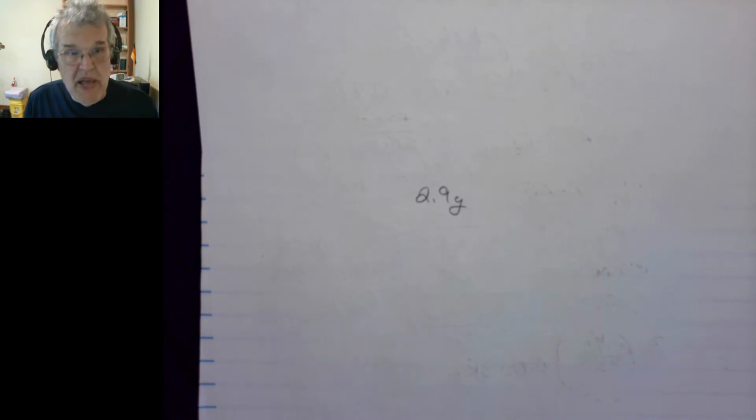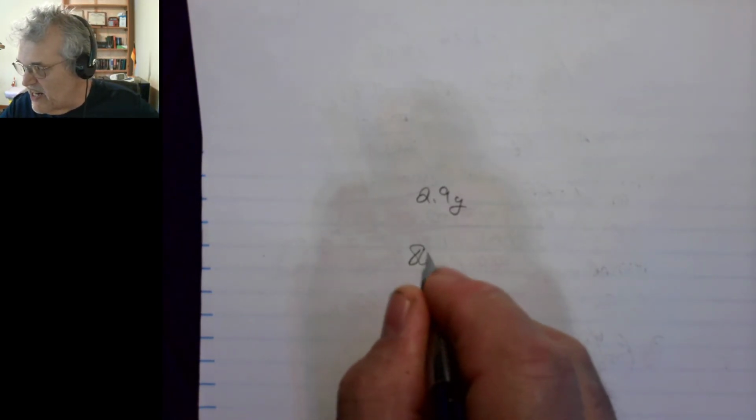It will start to melt, just like candle wax, same thing. It will start to melt, and then you'll be able to get the thermometer down in there. And once it melts enough, you get the thermometer in there, stir it with the thermometer, and keep stirring it, and read the thermometer, and get it to where the temperature gets up to at least 80 degrees Celsius. Okay, you want it to be at least 80 degrees Celsius.